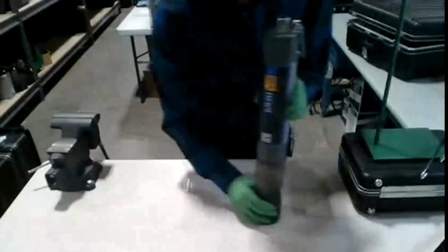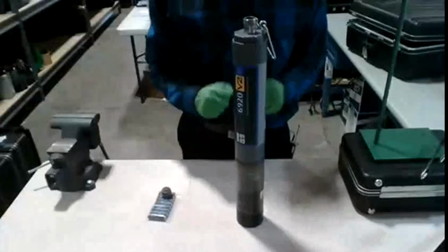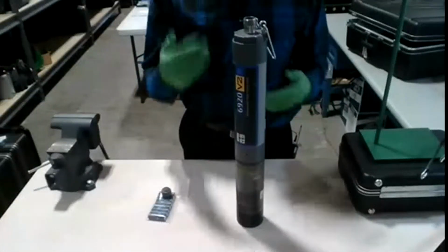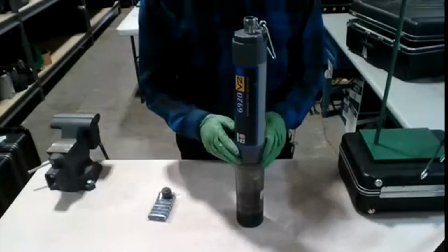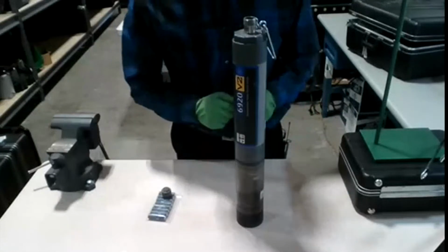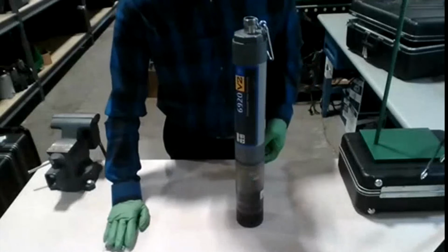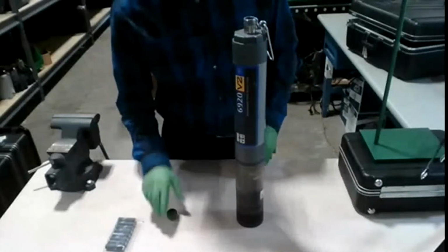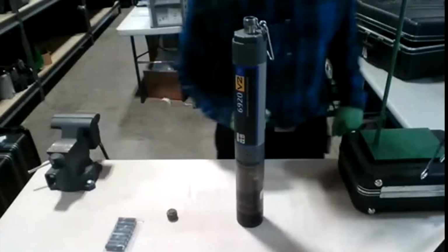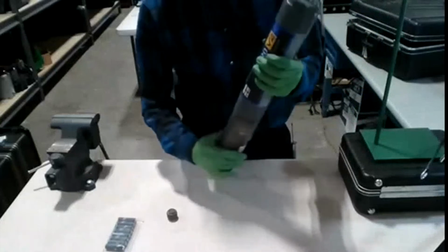Now, I'm gonna show you guys how to do discrete sampling first, because it's the easiest, and in most cases, when people want to just do on-the-spot sampling, it literally takes about 3 steps to do. So we're gonna go over that right now. The batteries aren't needed to do discrete sampling because the power is actually going to come from the 650 display. So what do we need? We need the sonde. So we would take it out of the case. It's pretty much ready to go.